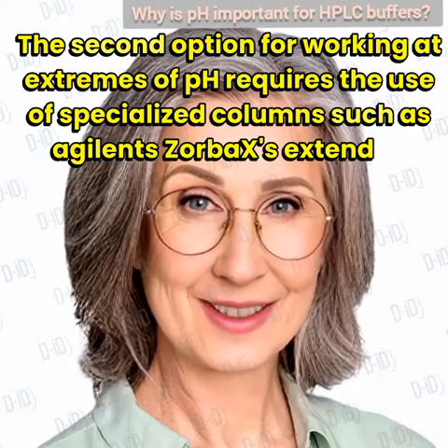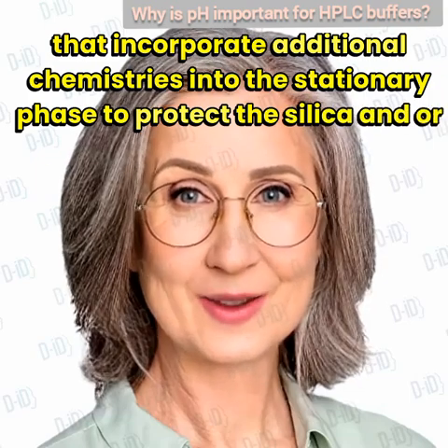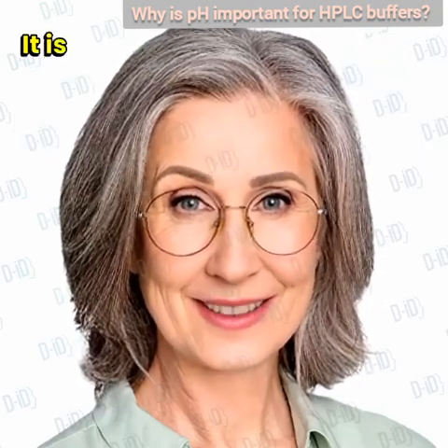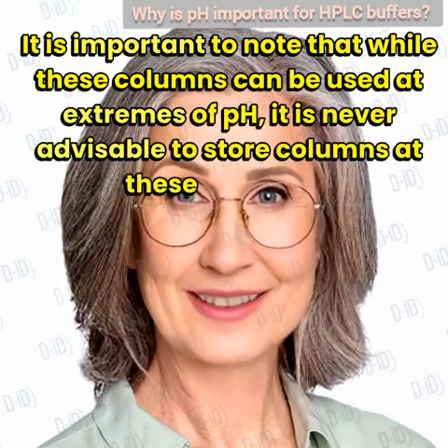The second option for working at extremes of pH requires the use of specialized columns, such as Agilent's Zorbax Extend or Zorbax StableBond, that incorporate additional chemistries into the stationary phase to protect the silica and/or the bond retaining the stationary phase. It is important to note that while these columns can be used at extremes of pH, it is never advisable to store columns at these extremes.